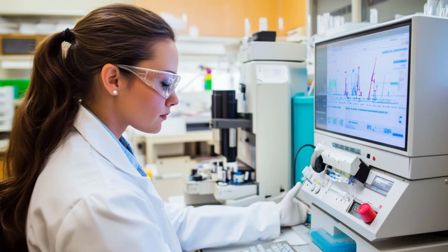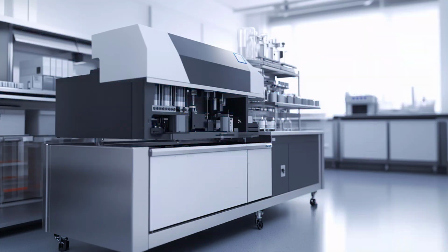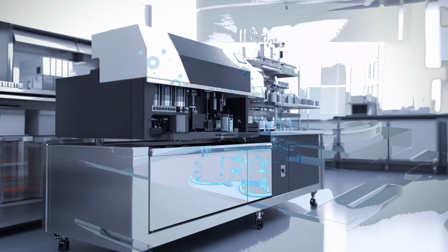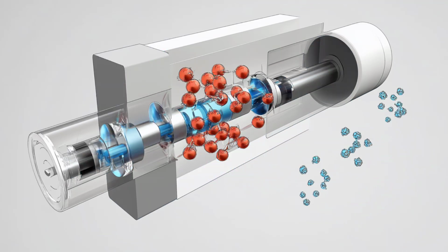Mass spectrometry, MS, is an analytical technique used to measure the mass-to-charge ratio, m/z, of ions. By analyzing these ratios, MS can identify and quantify molecules, determine their structure, and study their chemical properties. The technique relies on three main steps: ionization, mass analysis, and detection.